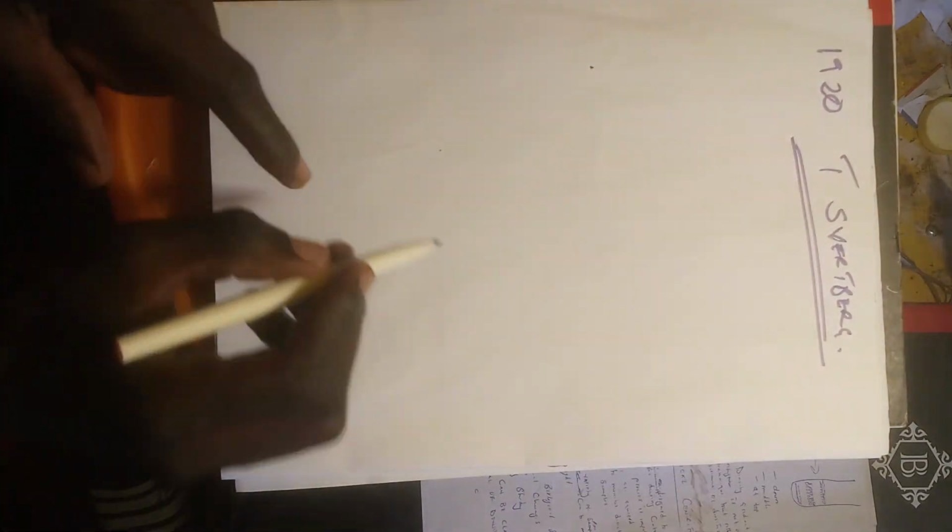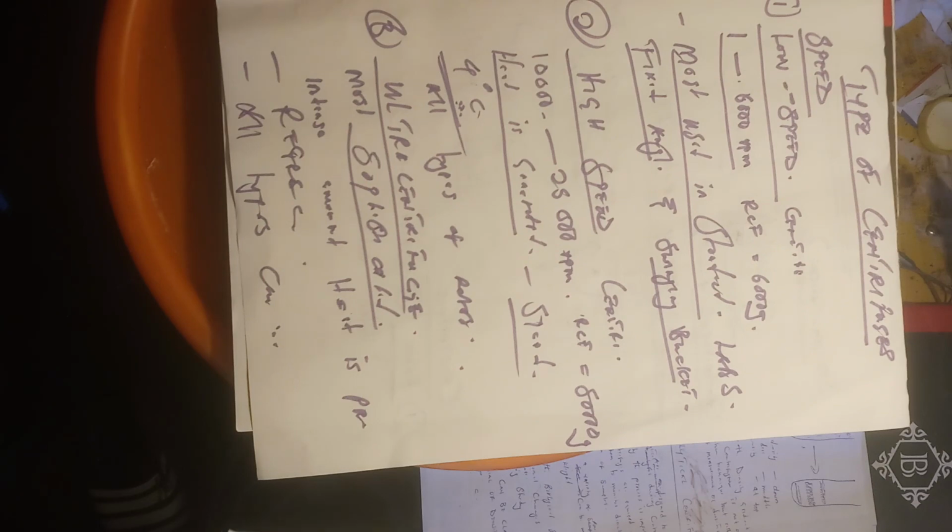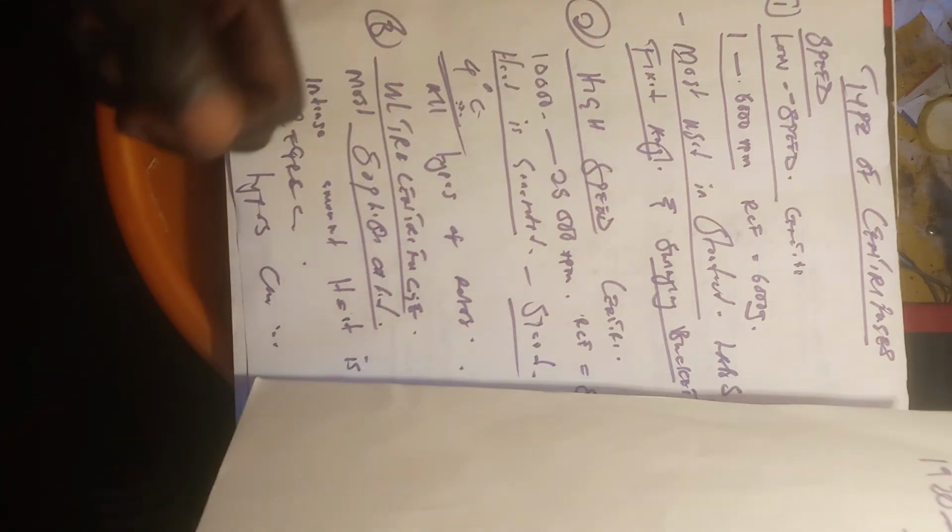And just a little bit of history, just for you to understand. In 1920, Theodor Svedberg mounted the first analytical ultracentrifuge. That's the history right there that you can know. If you want more information on that, you can search, because it is quite complex, it is quite large, but that's just that. And just by saying this, we can say the basic principles of centrifugation have been elucidated.